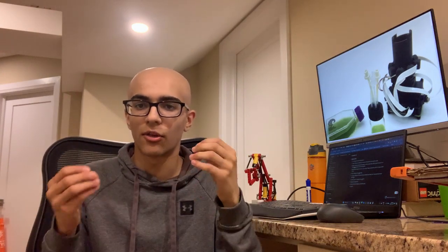So there you go. That's what I have planned for my next experiment. I'm super thankful to Cameron and everyone at Pioreactor for offering to send me a free bioreactor. I'll be getting that over the next couple weeks, when I'm going to be able to start my experiment. But now that I have an experiment plan, my next step is just going to be getting the materials together other than the bioreactor, getting my algae grown and everything, so that when I get the bioreactor, I can start experimenting right away.